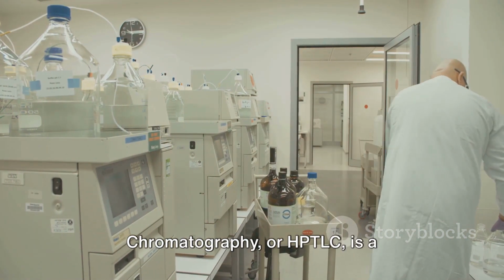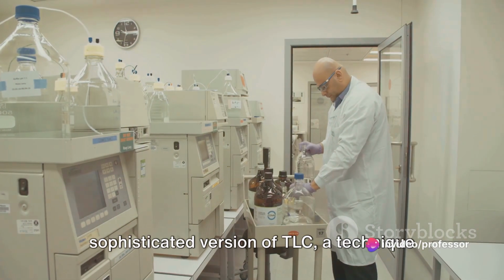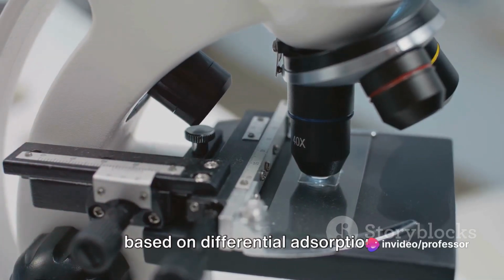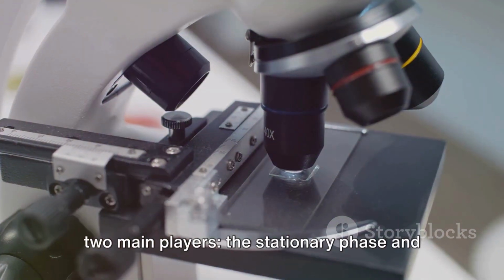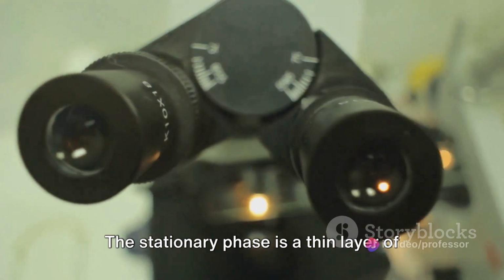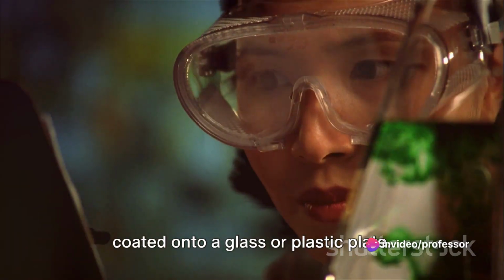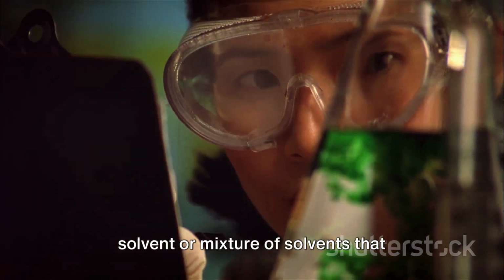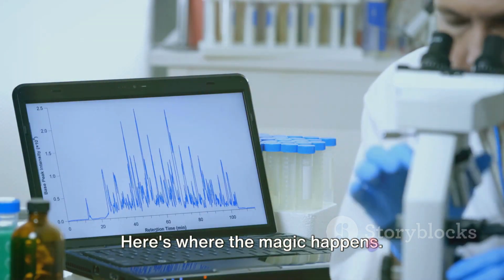High-performance thin-layer chromatography, or HPTLC, is a sophisticated version of TLC, a technique that allows the separation of mixtures based on differential adsorption. In the world of HPTLC, we're dealing with two main players, the stationary phase and the mobile phase. The stationary phase is a thin layer of adsorbent, often silica gel or alumina, coated onto a glass or plastic plate. The mobile phase, on the other hand, is a solvent or mixture of solvents that travels up the stationary phase. Here's where the magic happens.